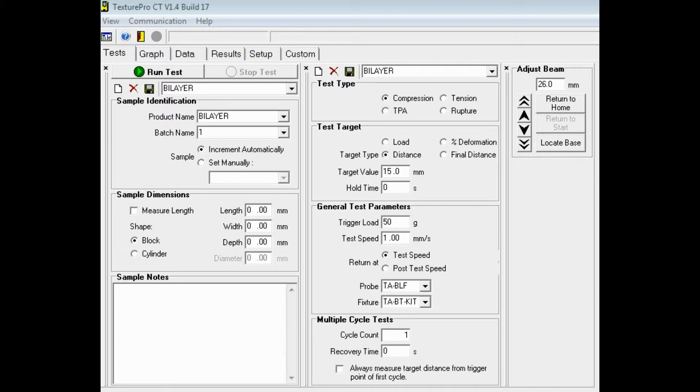Sample identification and dimensions are entered on the first column of the screen. The test settings are entered in the second column, and the icons on the third column are used to lower or raise the instrument arm.